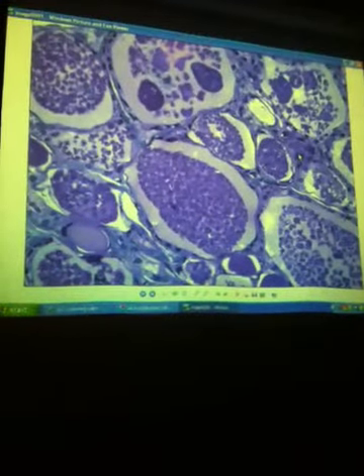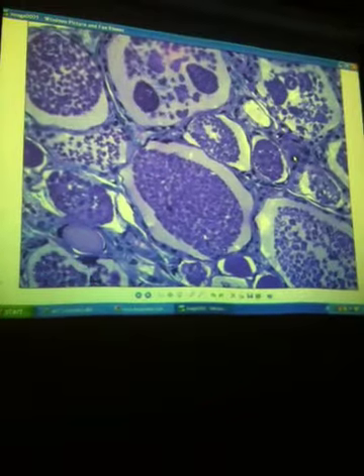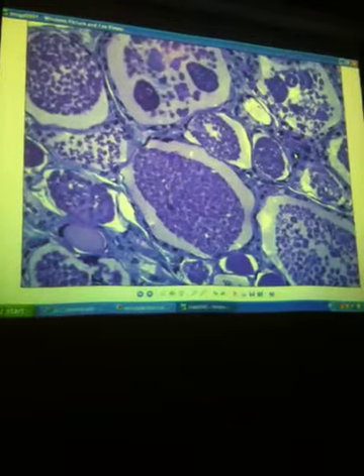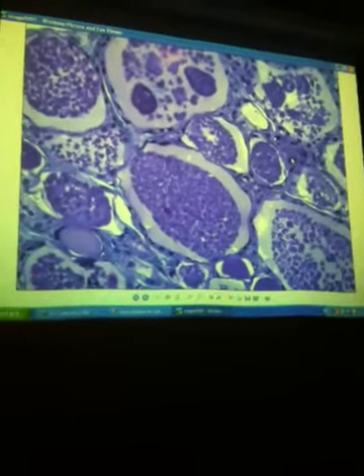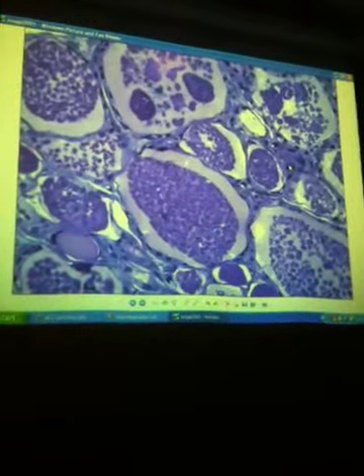But you're always looking for something like this. This is at the highest power. This is at 40 power. So very different in terms of the level that we're looking at it. And it would always be shown at 40? Always at 40, because otherwise we can't really tell the difference between them.